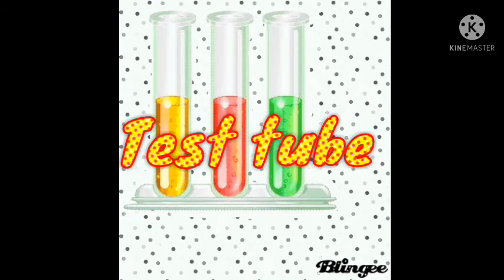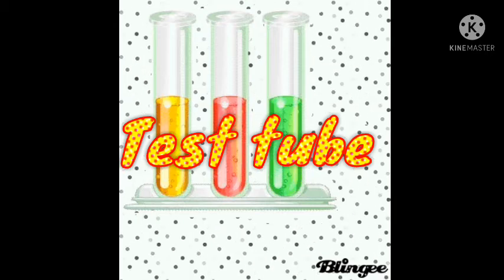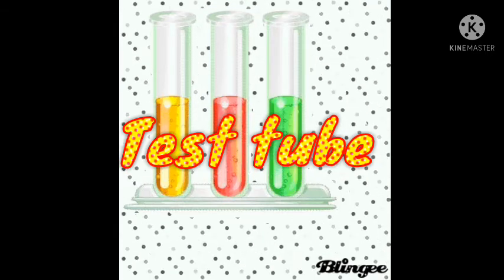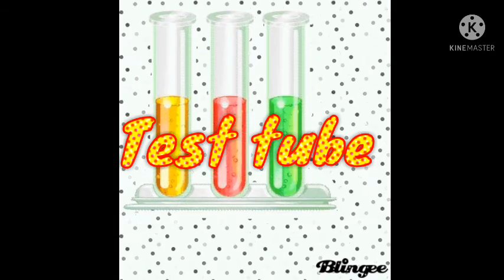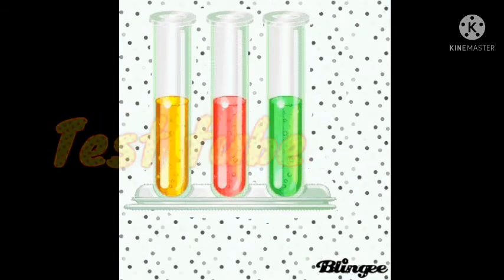Test tubes are used to hold chemicals during an experiment, for example, holding a corrosive chemical like acid. A test tube is used to hold those kinds of corrosive chemicals.